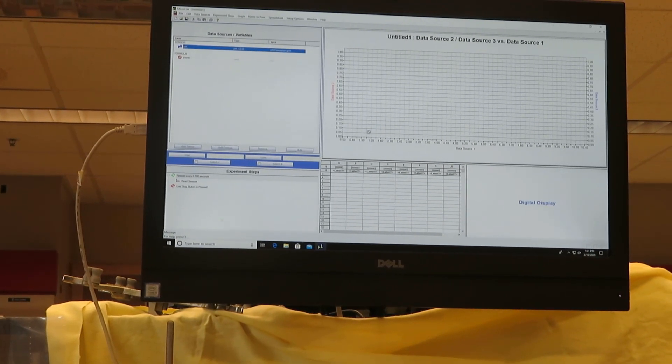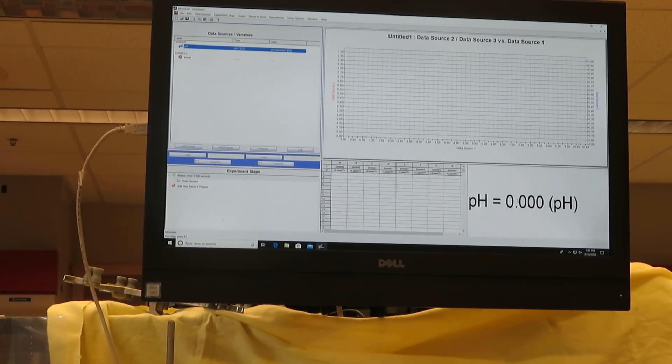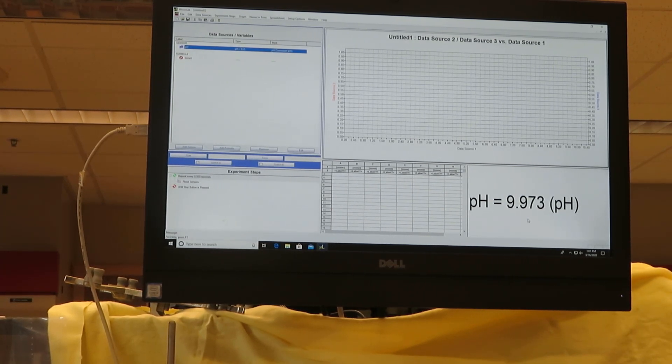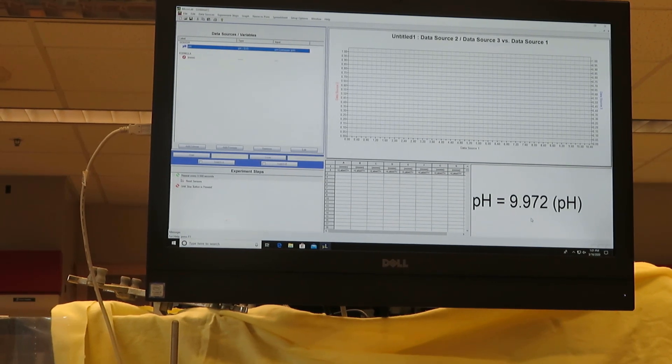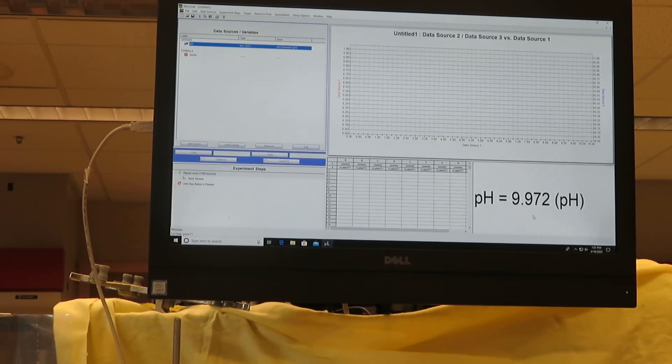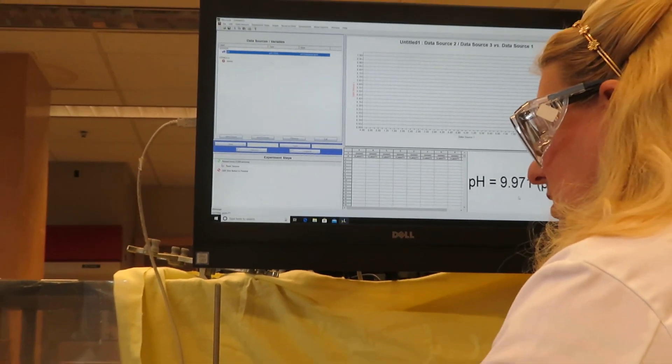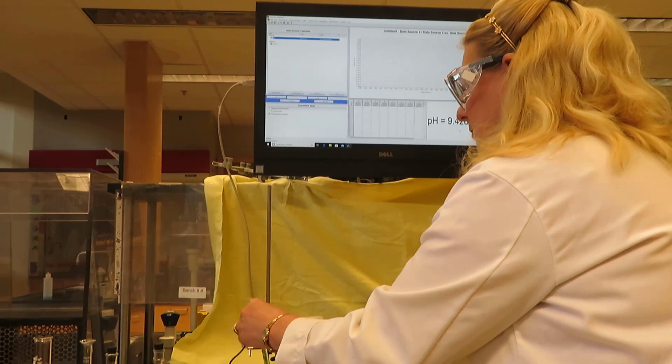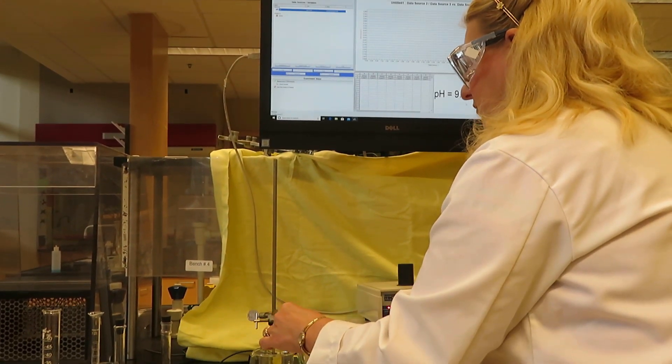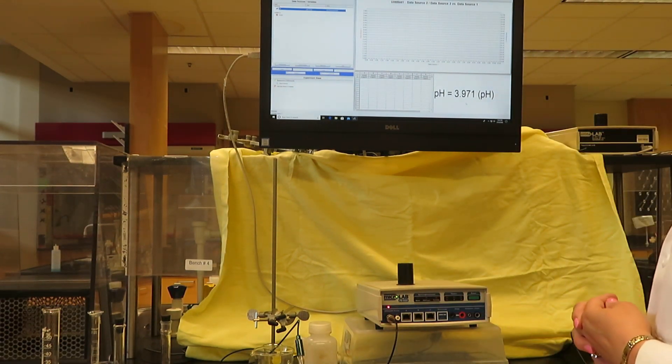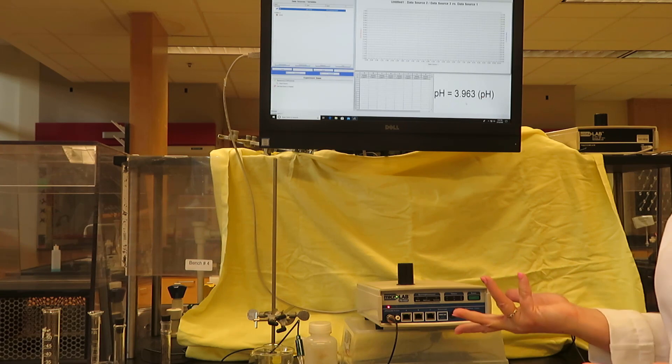Now, to read what the pH meter is sensing, I'm going to drag it here. One of the important things to do after calibration is to go back and measure your solutions to make sure they're reporting pH accurately. Let me start with pH 4 buffer. You can see it's reasonably close to 4 - it's reading 3.963. That's good.